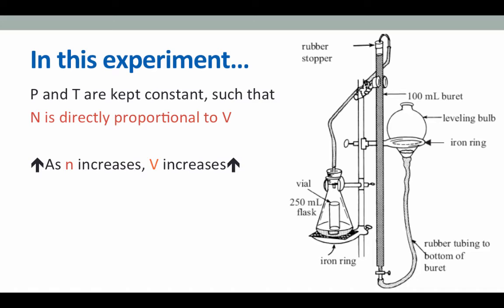So we're going to look at the relationship between moles of gas and volume. Remember, this is a direct relationship. So as we have gas produced, so as the number of moles of gas increases, we should also see an increase in the volume.